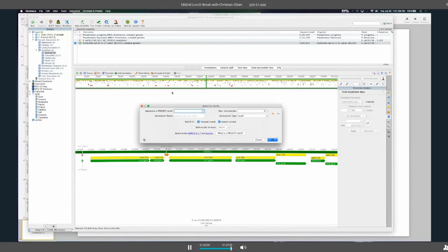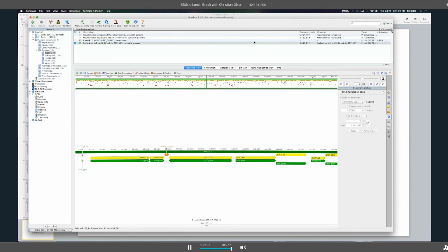Sorry, I'm not very much aware of the second way that you showed, but basically, to refine the question, it would be very useful if you could make a small database of 5 or 6 motifs that you are regularly searching for, so you can always be searching for this set of motifs, for example. Okay, so you can do that as well.